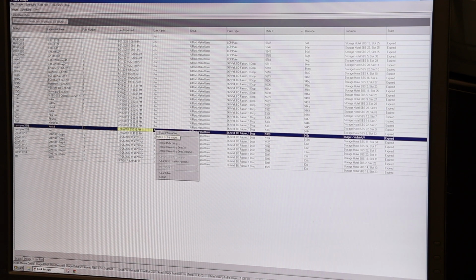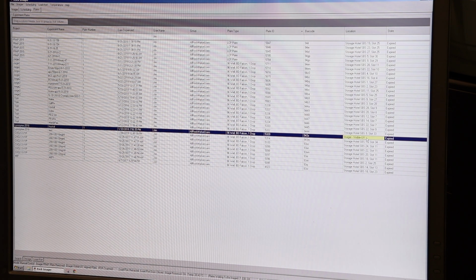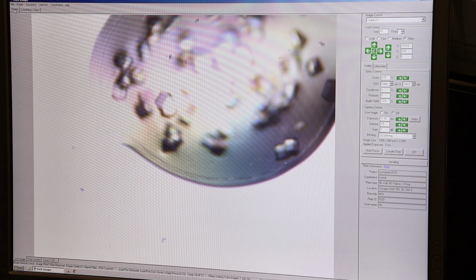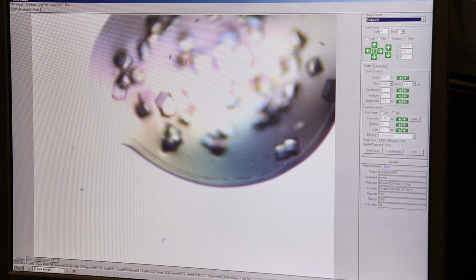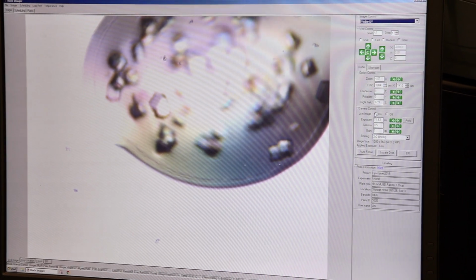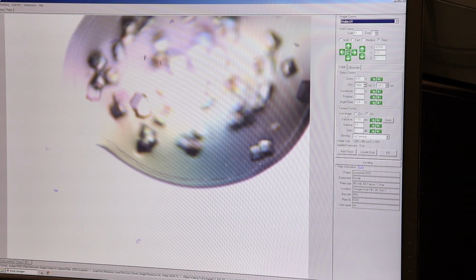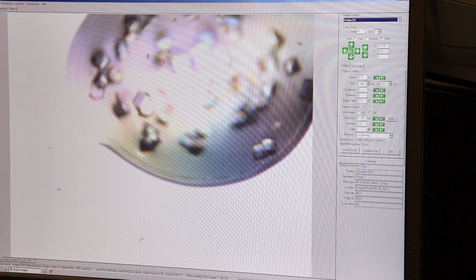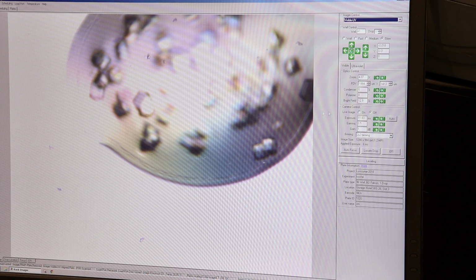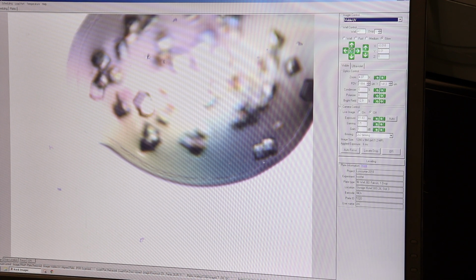Okay, so that's up on the UV imager now. So if I go up to Imager here, make sure we're on Imager Control Visible UV. First thing you want to do is turn on the camera. So here, camera control on. Now, the way it's set up is it knows the plate definition, it knows the limits, so you can't crash the machine as long as you have the right plate definition in there. So don't be afraid of moving things around.